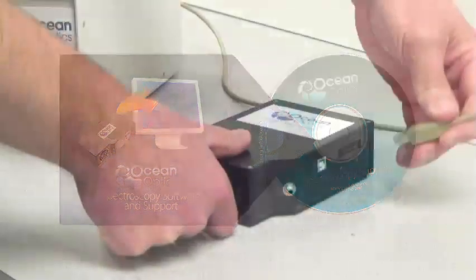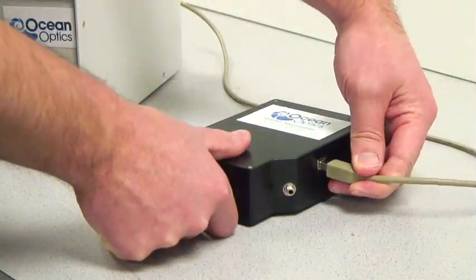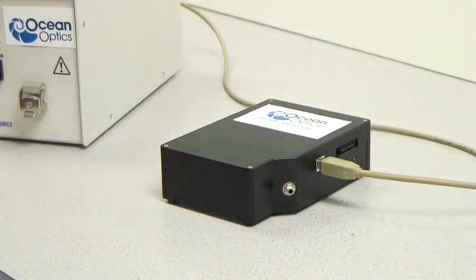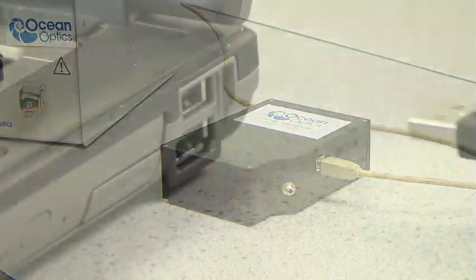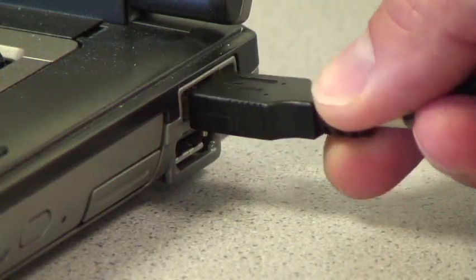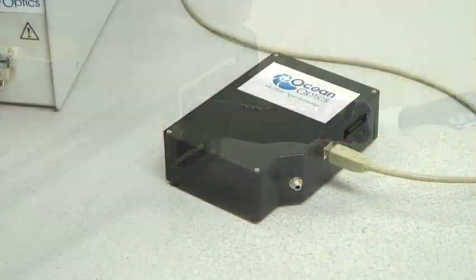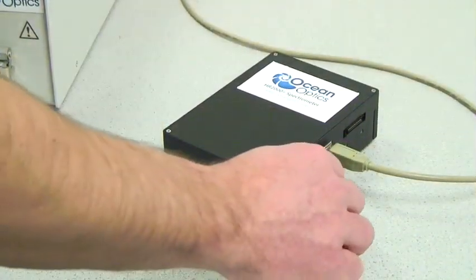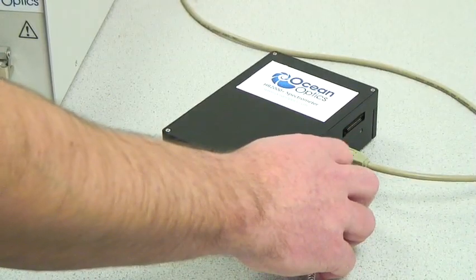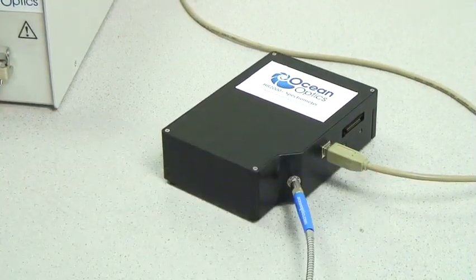To begin, connect the USB cable to your spectrometer and to the USB port on your computer. Connect one end of the patch cable to the SMA connector on your spectrometer.